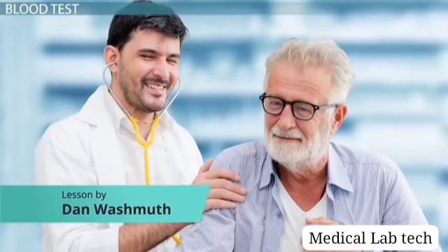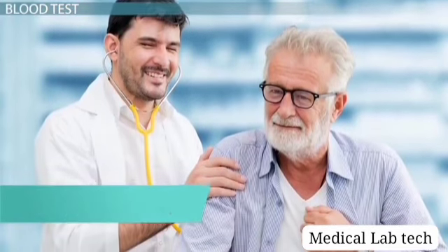Larry is a 66-year-old who just went to his doctor for his yearly physical. After reviewing Larry's results, the doctor recommended that Larry go to a nearby medical laboratory to get his blood levels of cholesterol, triglycerides, and electrolytes checked.